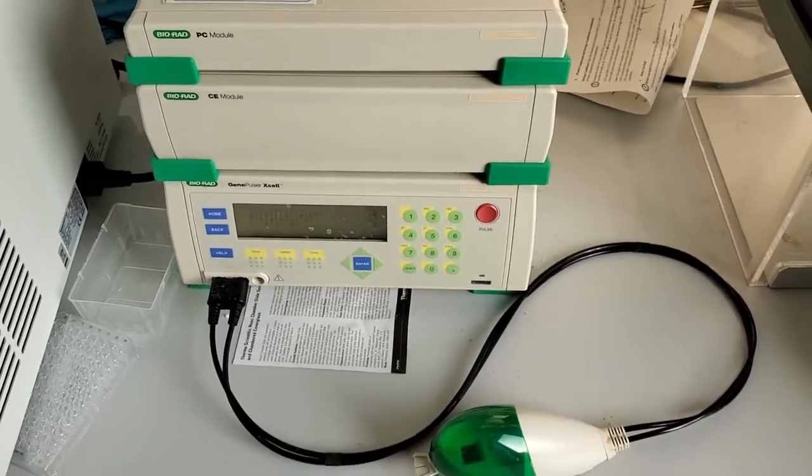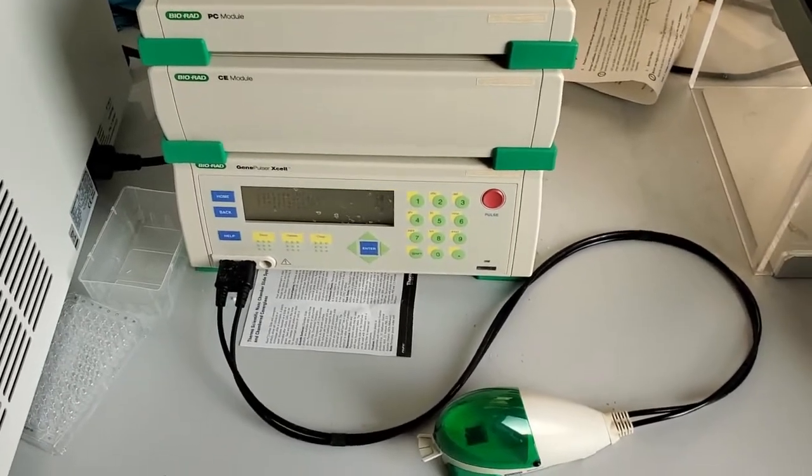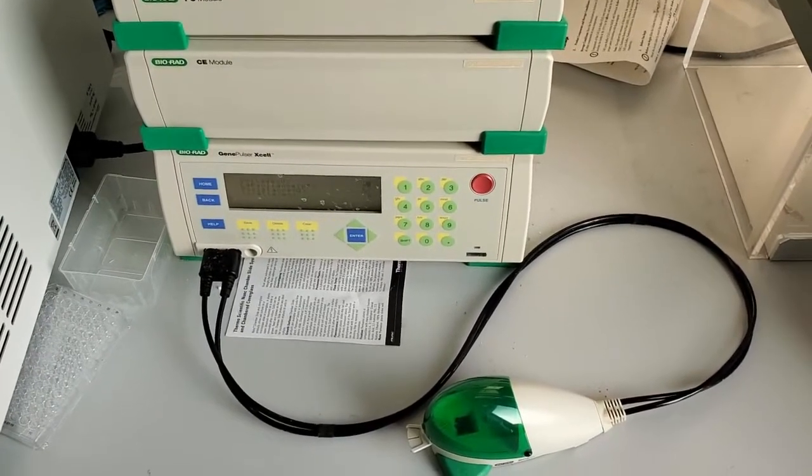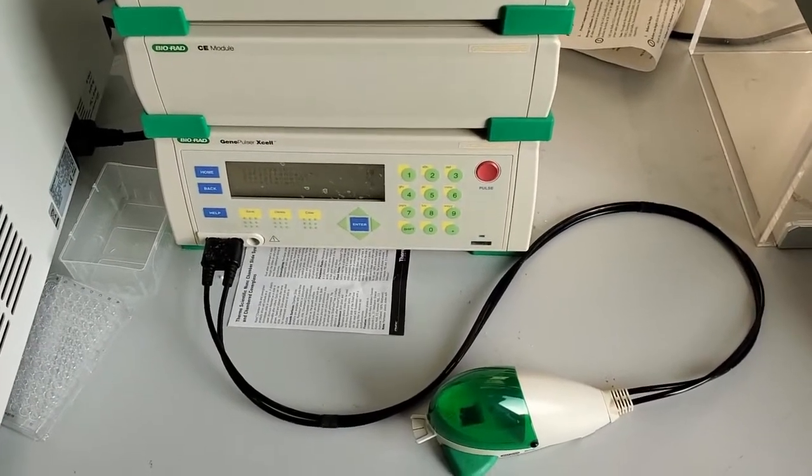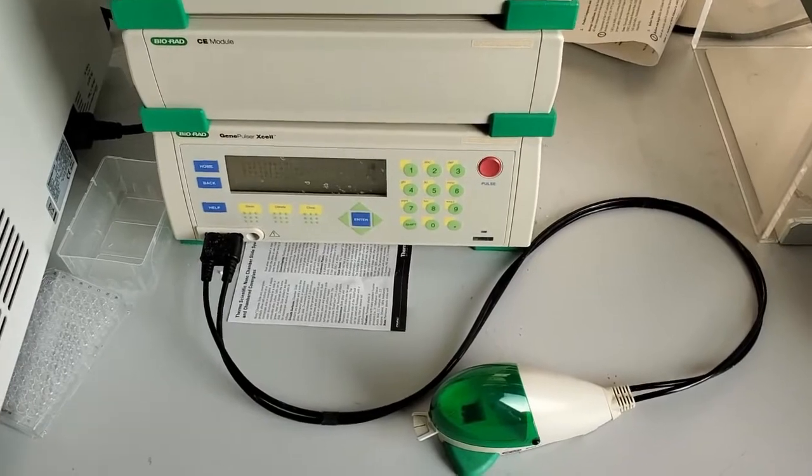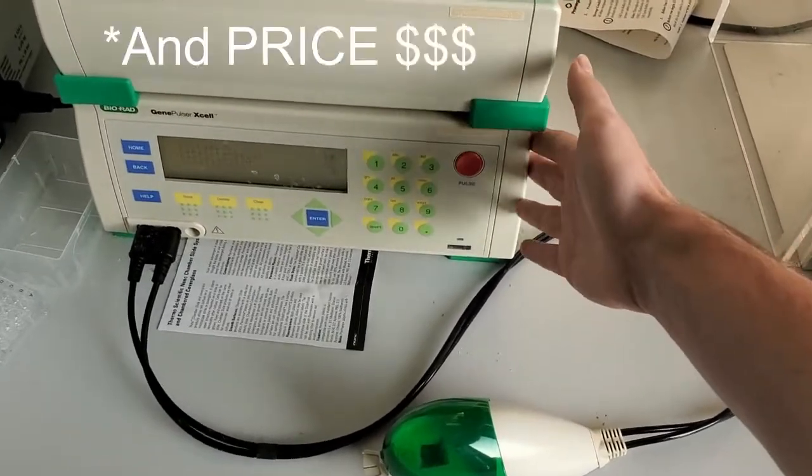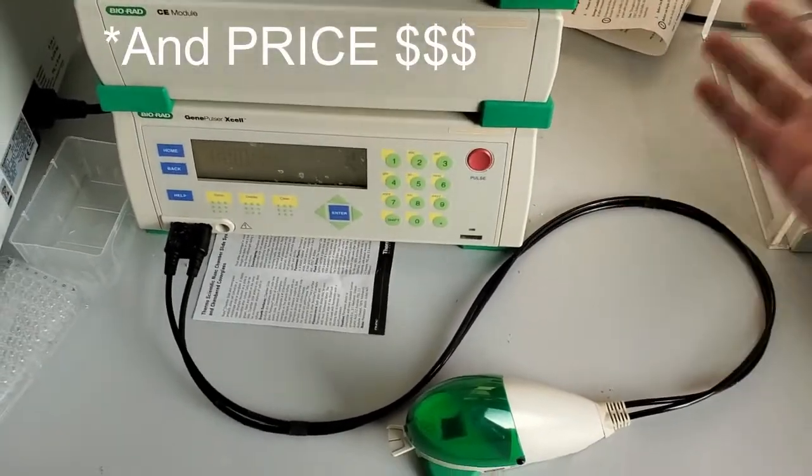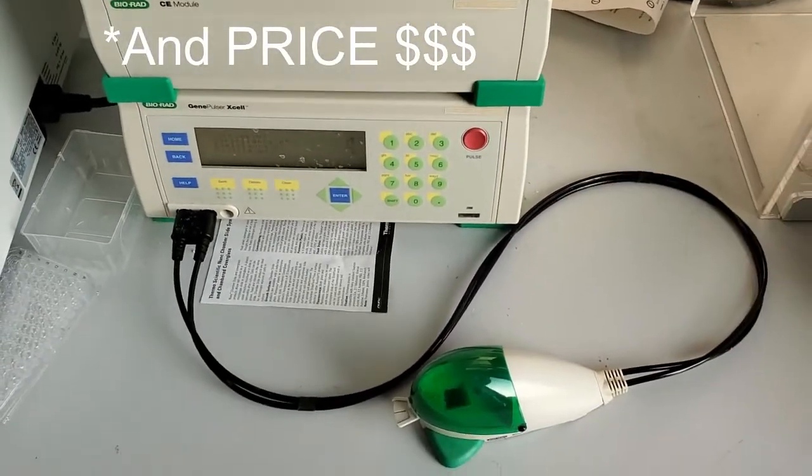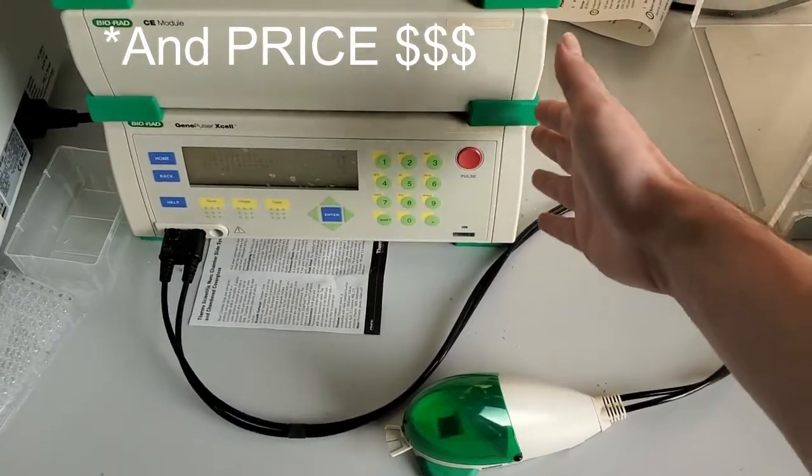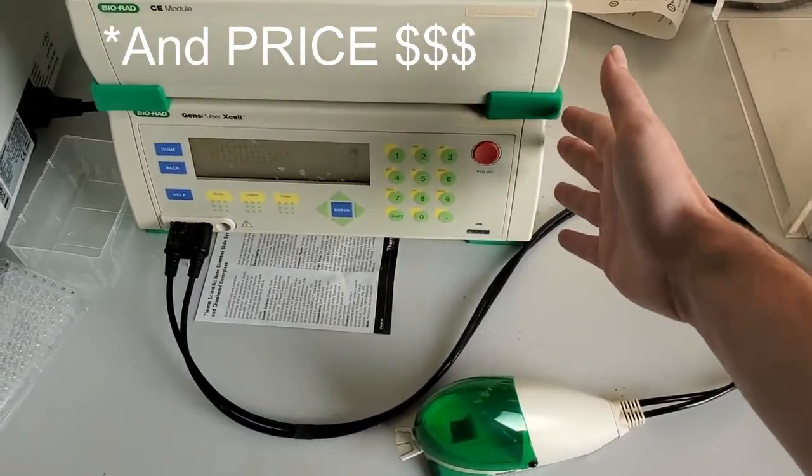The main difference between this and the DIY instrument, for example, that I've shown in previous videos is really the size in many ways. And I mean, consistency as well. But size, I think, is the biggest difference.